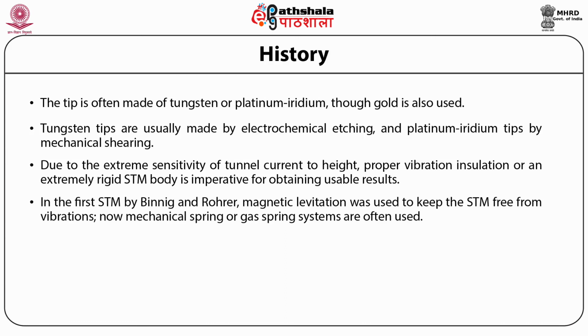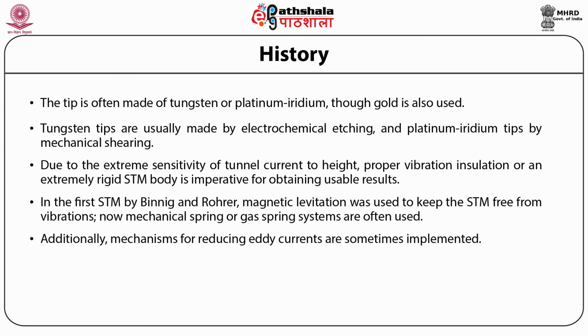In the first STM, by Binning and Rohrer, magnetic levitation was used to keep the STM free from vibrations. Now mechanical spring or gas spring systems are often used. Additionally, mechanisms for reducing eddy current are sometimes implemented.